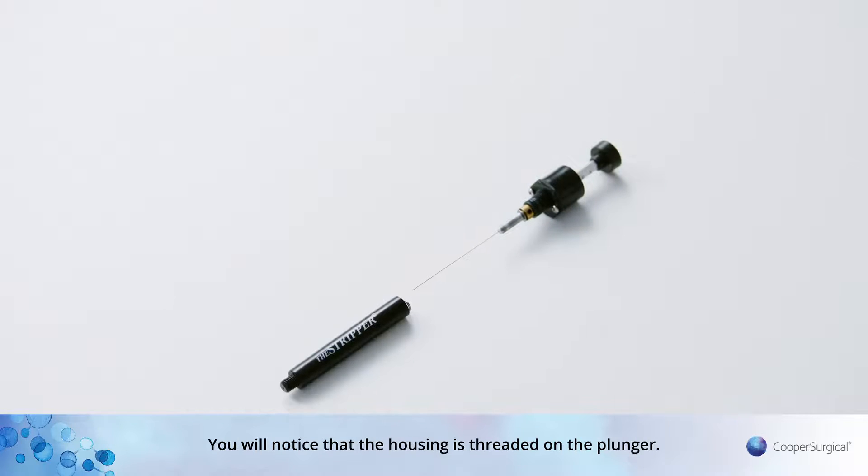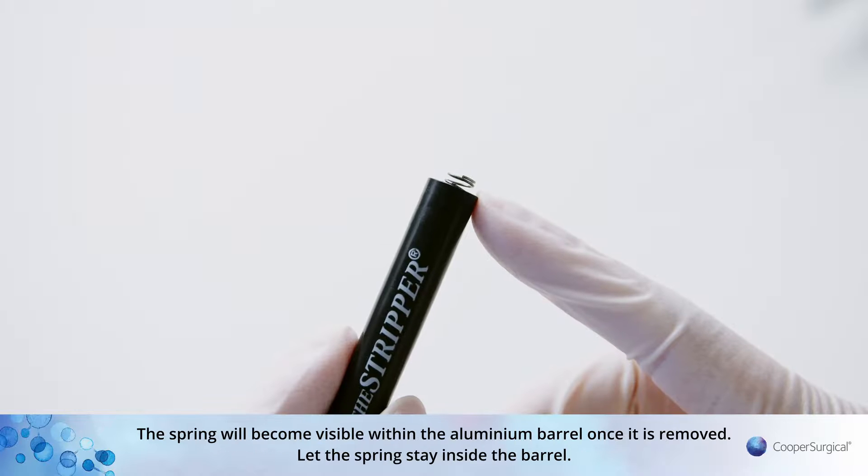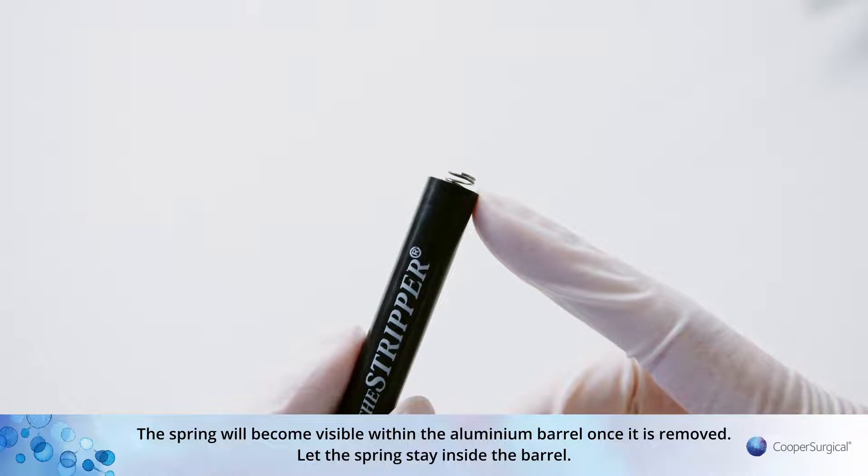You will notice that the housing is threaded on the plunger. The spring will become visible within the aluminium barrel once it is removed. Let the spring stay inside the barrel.